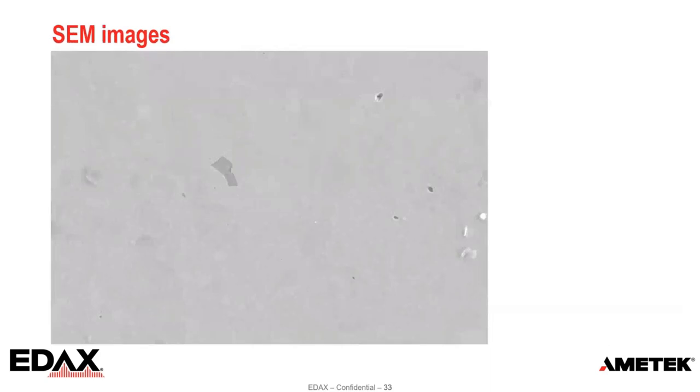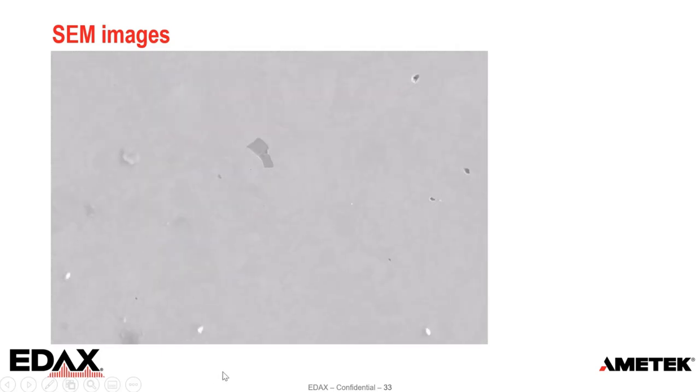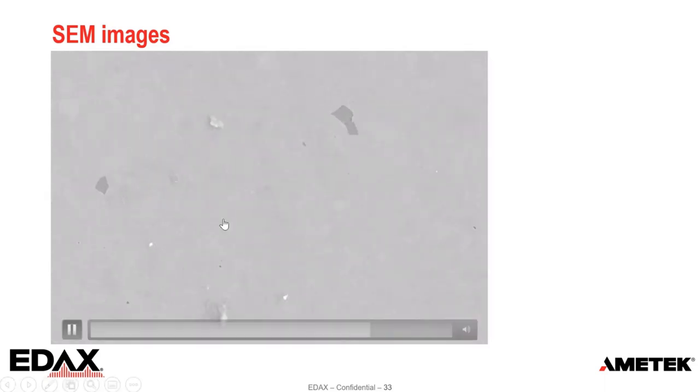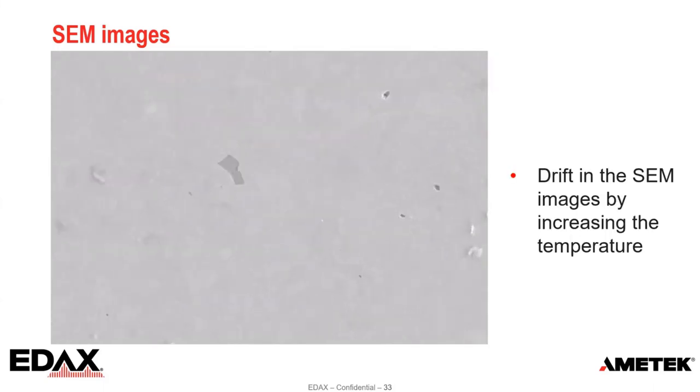So again, after every single heating step, I collected the SEM images, and these SEM images were put into a movie. So again, I will play the movie and we will see if there is any change acquired after the heating process. So we can again see a shift in the SEM image by increasing the temperature. And this phenomenon was also observed when acquiring the measurement with the titanium aluminum alloy.